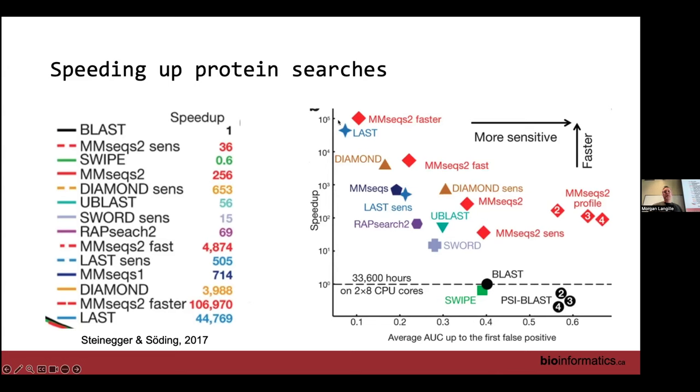But if you start maybe with either trimming down your taxa to interest or functions of interest, you can sort of quickly see what's driving some of that signal. And you'll get a chance to play with it today. Okay.